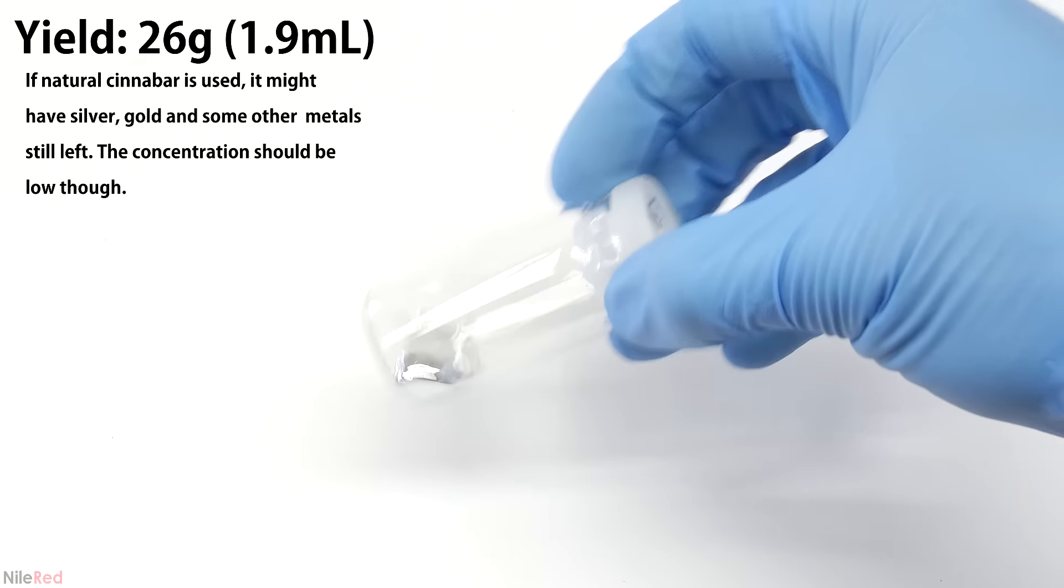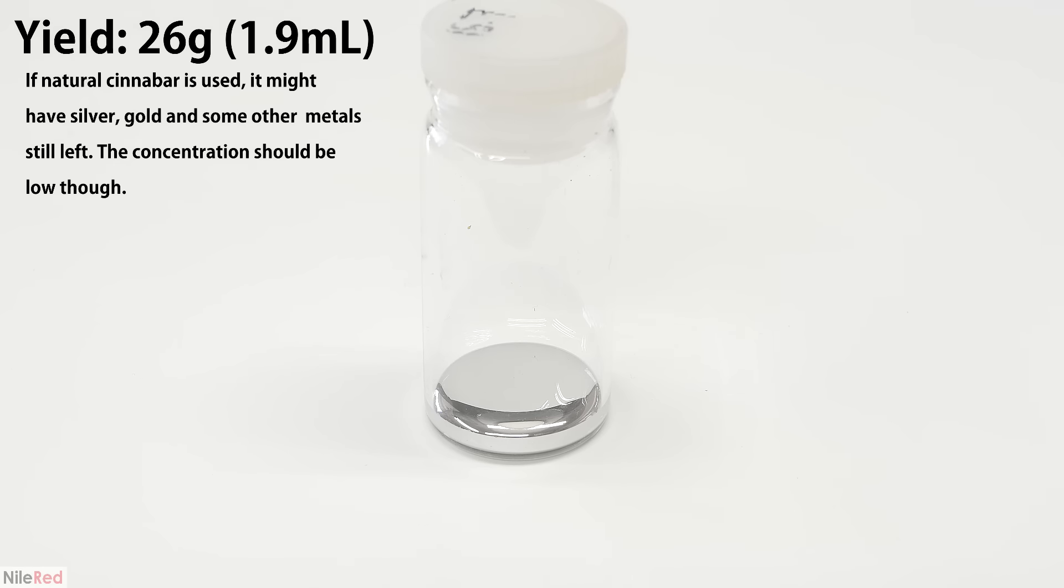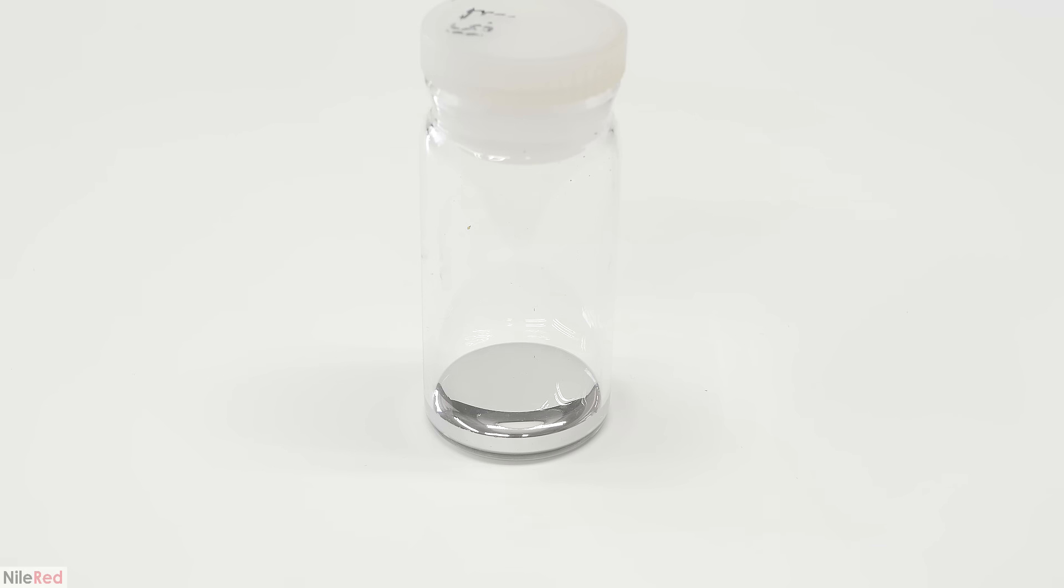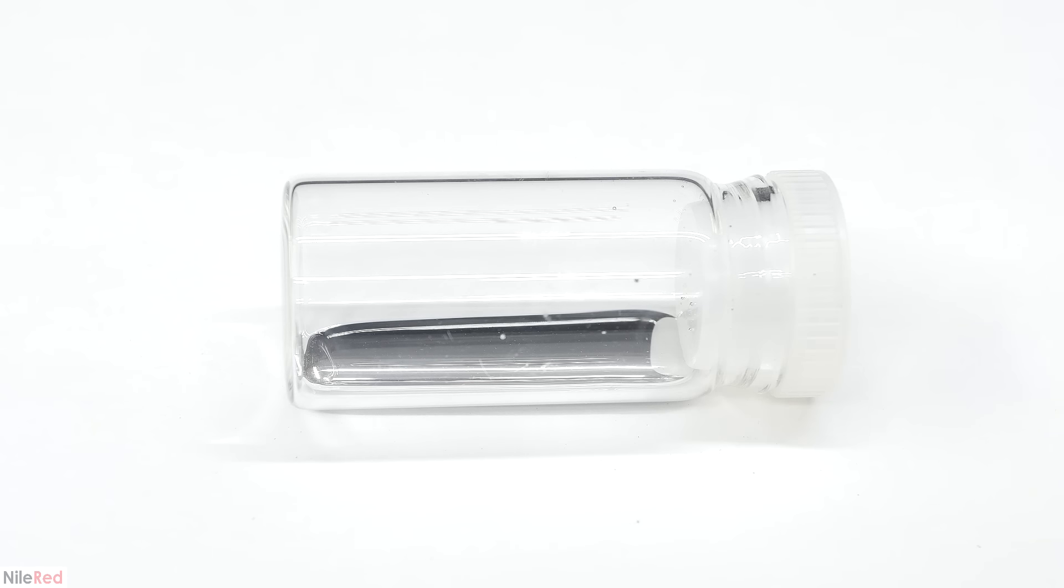The final yield of mercury is 26 grams, or 1.9 milliliters, which corresponds to about 30.2 grams of pure mercury sulfide. Considering that I started with 270 grams of waste, it means that most of what I had was just silica gel and sea light. This actually makes sense because the reactions that I used the mercury in were all pretty efficient, so I wouldn't expect there to be too much in the waste. If all of my mercury sulfide had been somehow pure, I would have gotten around 230 grams of mercury metal, or 17.2 milliliters, which is nearly 10 times more.